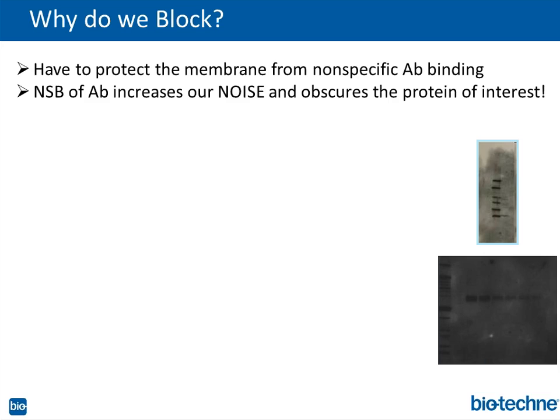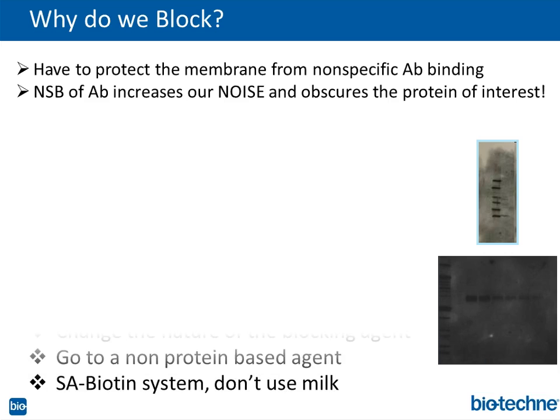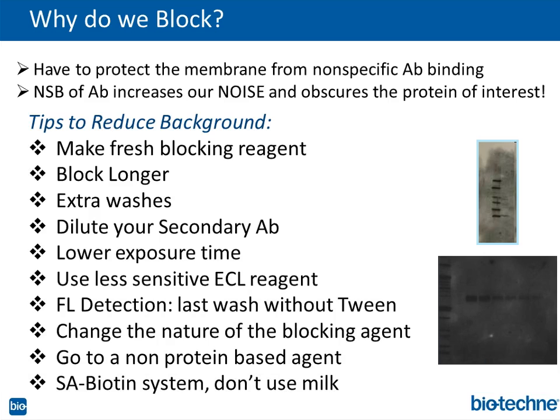So we block, and a lot of people use all kinds of blocking agents. There's 3 to 5% non-fat dried milk, which is very, very common. My comment on that is that you can use commercial sources from companies, or you can use something from the supermarket, Carnation or what have you. It really depends on your antibody system and what works best in your situation. It might be a busy slide here, but I was trying to collect my thoughts on all of the different variables that one could manipulate.